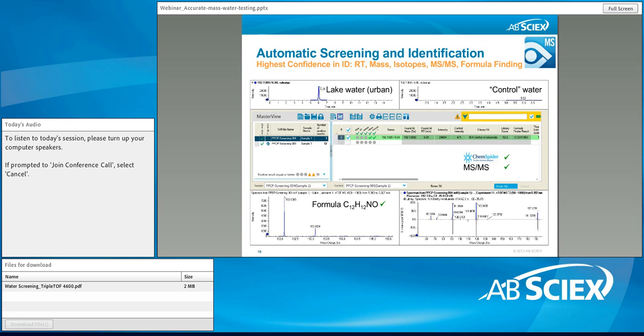Once this peak is identified, everything becomes kind of easy. The software automatically goes into the MS information to calculate the molecular formula. It also takes the MS information, which can be searched against large MS libraries, but also against the internet, against ChemSpider, to identify possible structures matching this molecular formula which was predicted for that water contaminant.